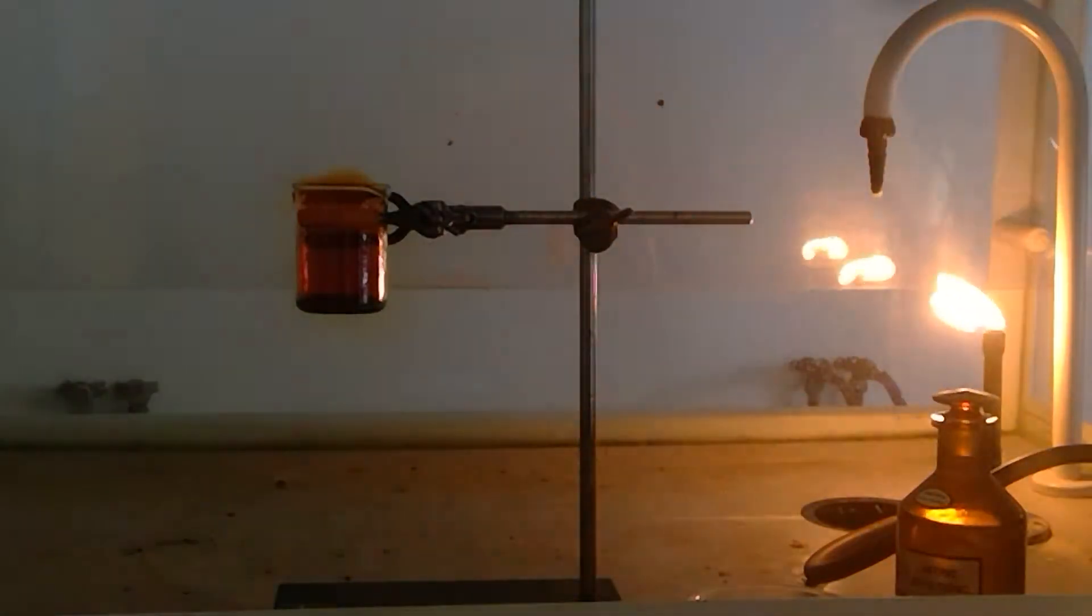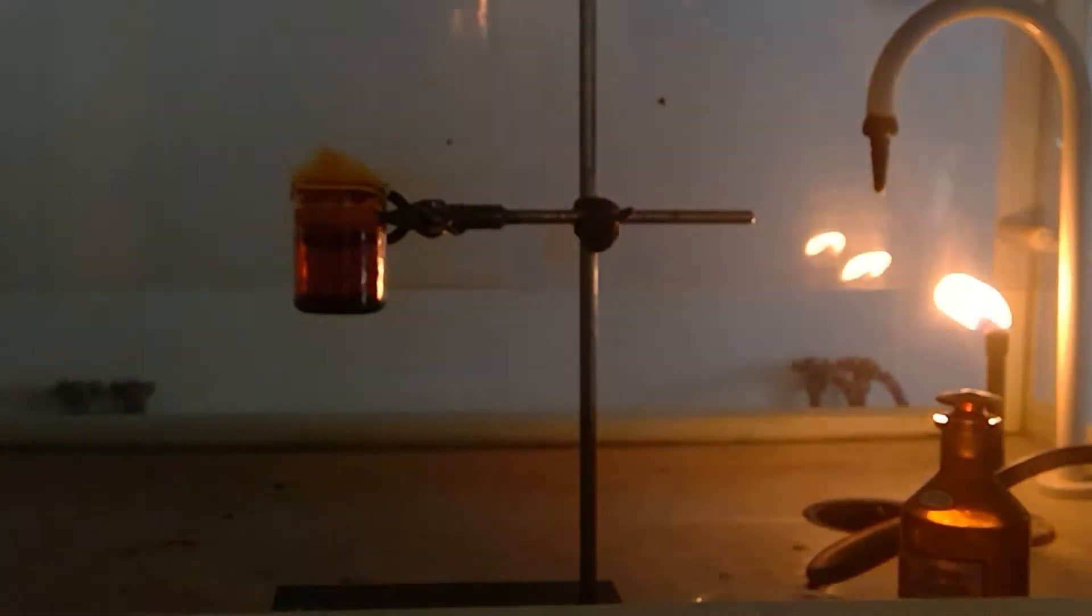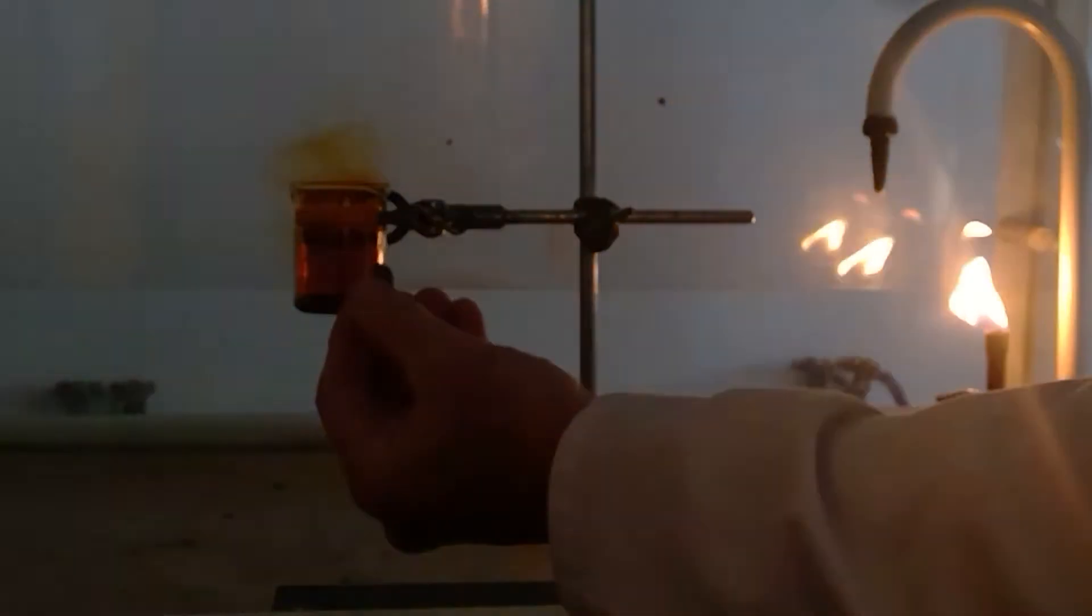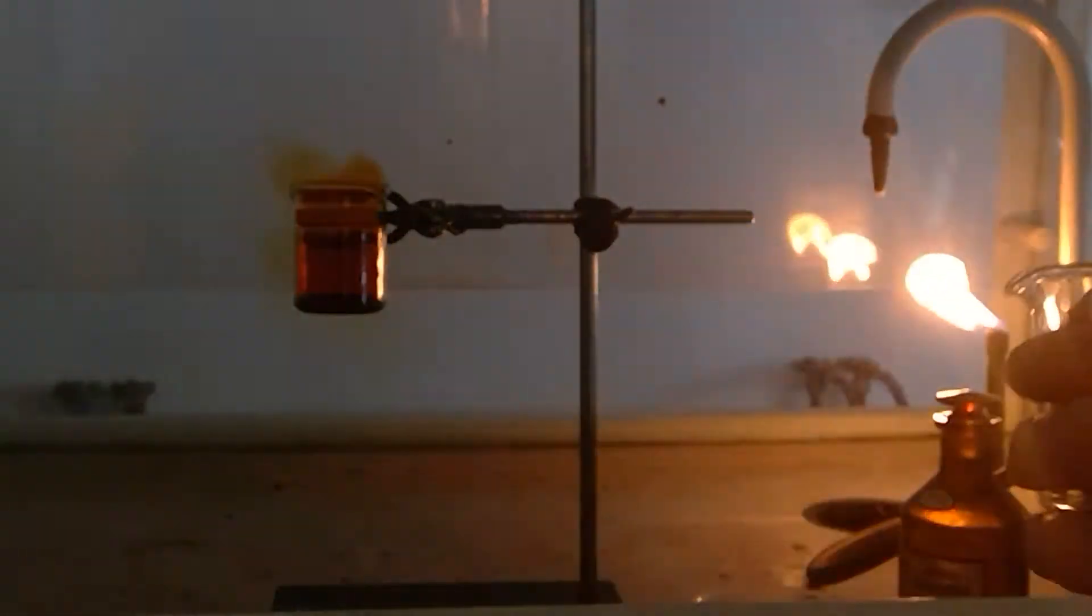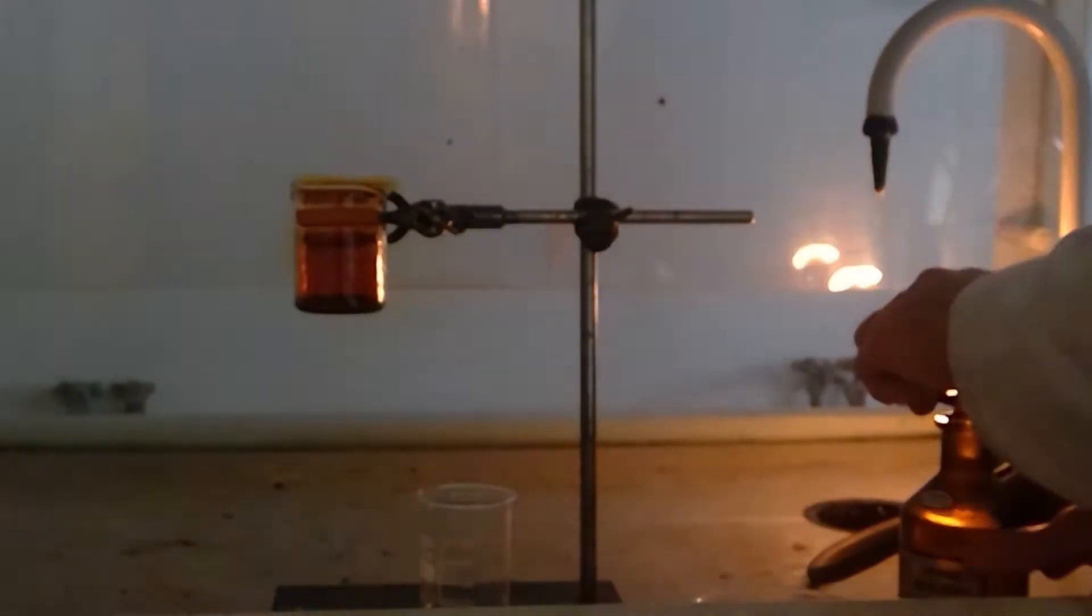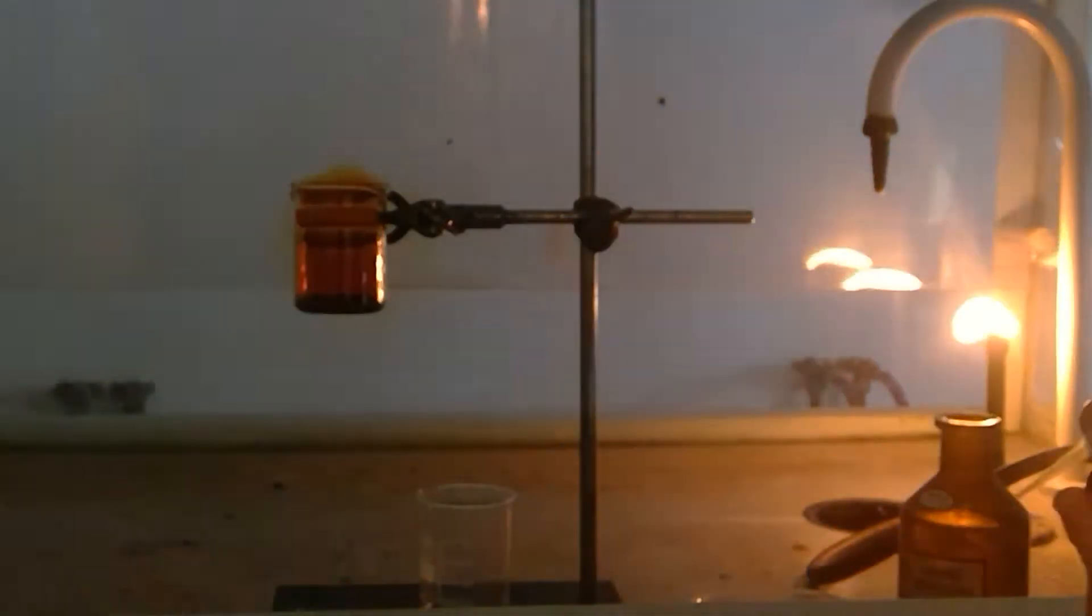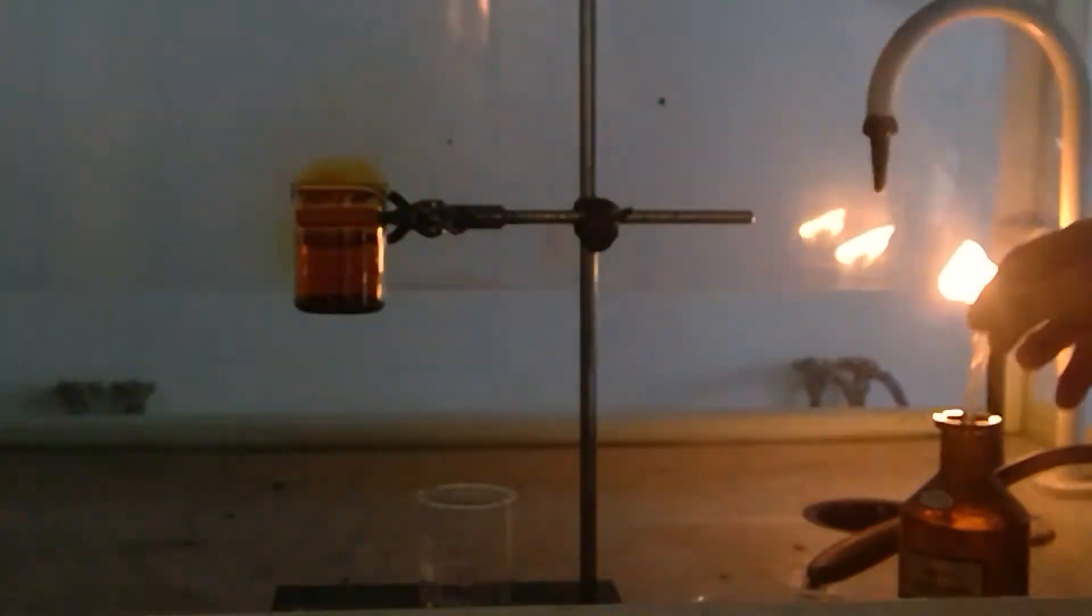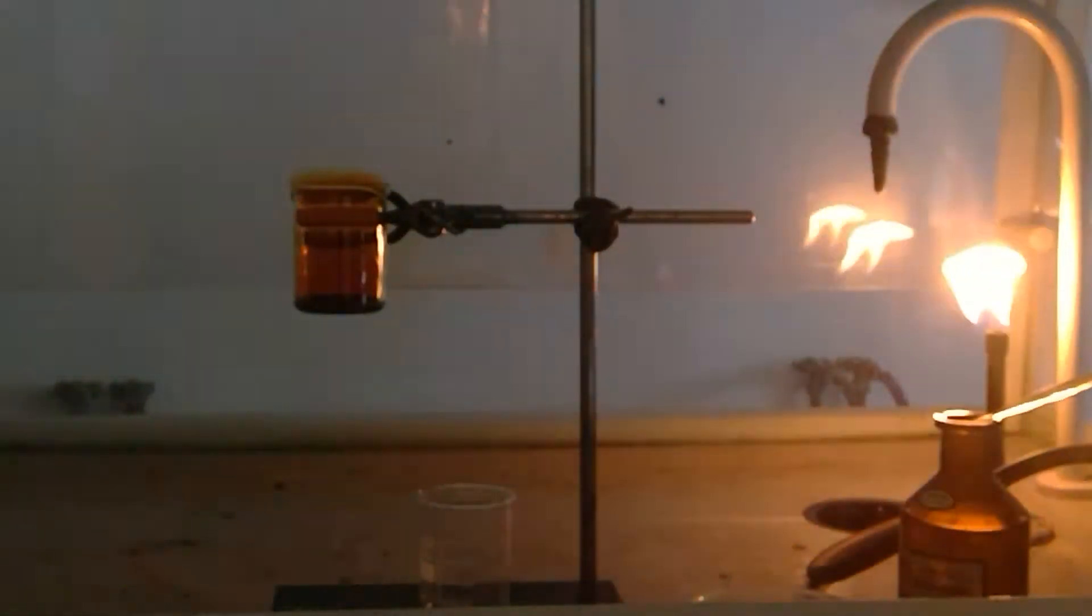This reaction can also be done with any copper containing solid. So for example with a coin that is mainly made of copper or has a high percentage of copper we could do the same type of experiment and add concentrated nitric acid to the alloy that contains the copper in the coin. This is a very effective way of throwing away your money.